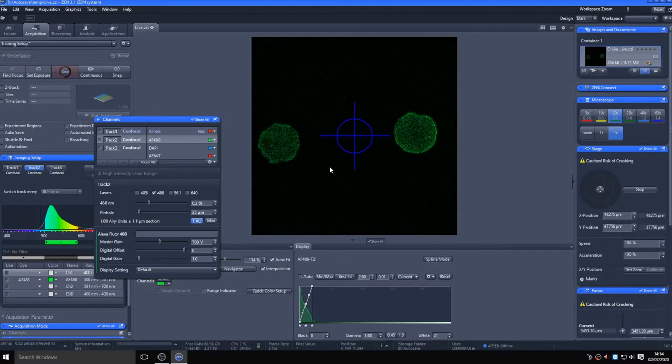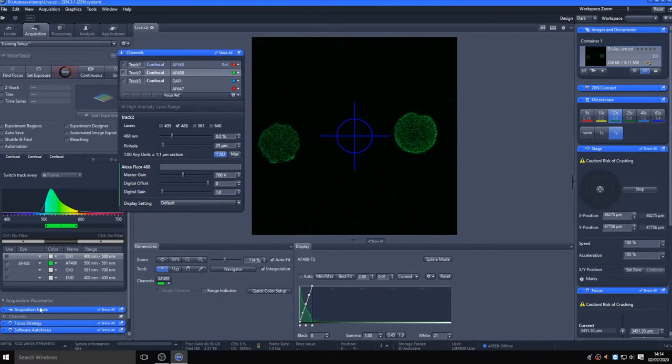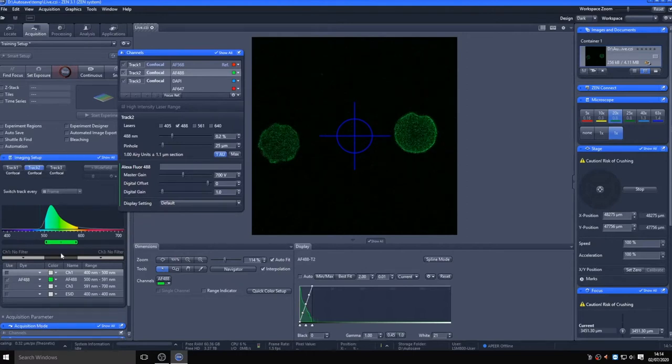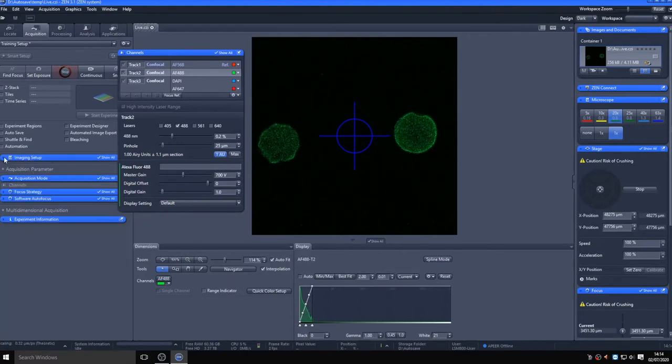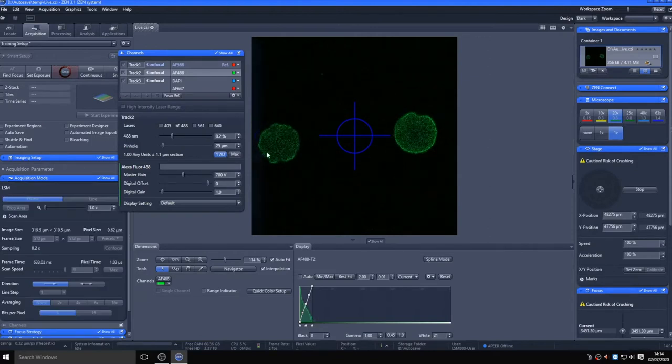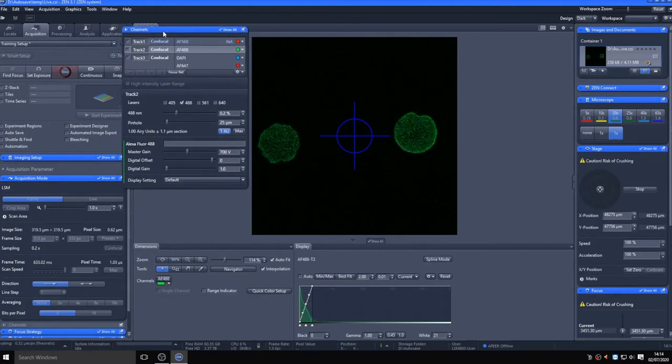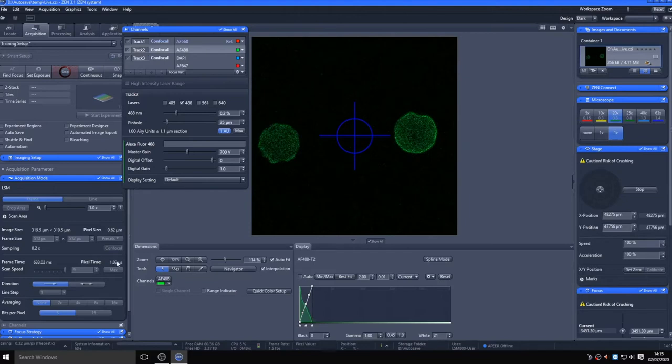Looking at the live image, you cannot see anything on the screen in the image field. However, looking at the histogram underneath, you can see there is data being captured. Alter the lookup table as appropriate for visualizing your data, but note that this is not altering your data, only the scaling on the monitor, allowing you to focus on an underexposed sample in order to avoid bleaching it.